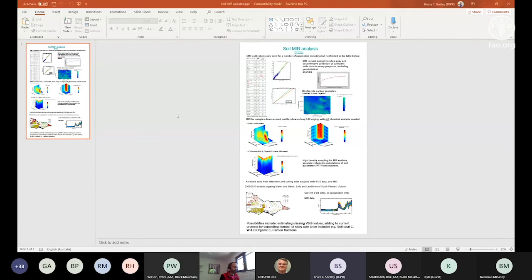but this is the way it should be done. The only variation on that is for some things like total phosphorus, we actually divide that into concentration ranges, then randomly select within that range for our calibration data sets. We also use Kennard Stone to look at the spectral bandwidth of the laboratory MIR, and then we use that to select a sample subset for handheld MIR, because we're not going to go back and run 1,000 samples or 2,000, 3,000, 35,000 samples through, and we've found that to work pretty good.